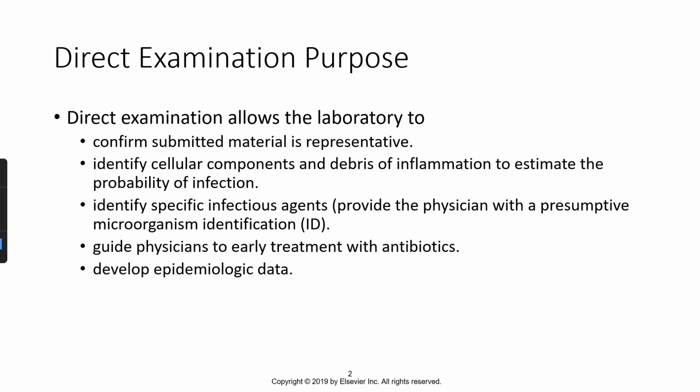There are some areas of the body where if you take a swab from that area and you put it under the microscope and you see certain types of bacteria, you can diagnose them on the spot. Or you can give a presumptive diagnosis and tell the physician what they're dealing with.